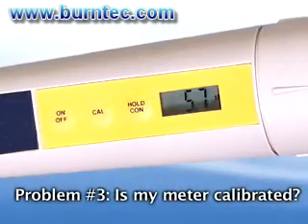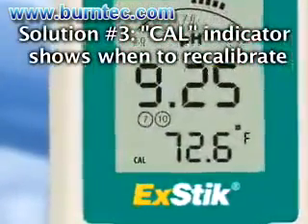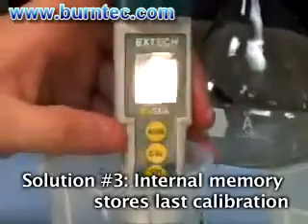Problem number three: how do I know if my meter needs to be calibrated? Solution: the ExDIC's cal indicator will appear when it is time to recalibrate the meter. The internal memory will store your last calibration and will display on screen to eliminate any guesswork.